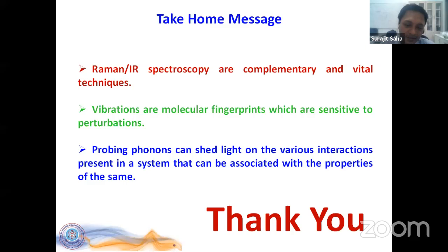Okay. So in the case of Raman spectroscopy, we just put the sample under the microscope or whatsoever, and then record. That means the photon interacts with the sample and then the scattered light is collected. Now, in the case of surface enhanced Raman spectroscopy, we have to do something additional. We have to treat the sample with a certain enhancer.